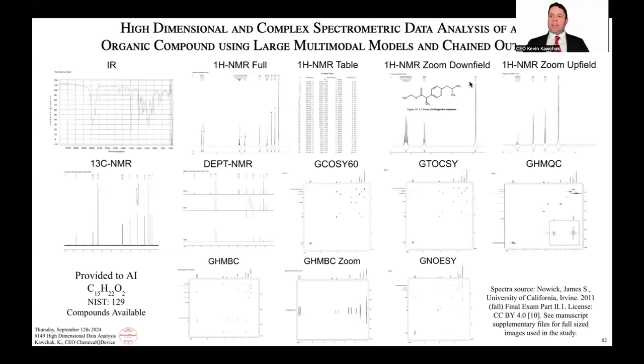So what had happened is, I took all these spectra and manually calculated where all the resonances are, the chemical shifts, as well as splitting patterns, for proton and then C13 DEPT. And then the 2D NMR, it's about correlations, so I did the correlations as well. And this was the structure that 3.5 Sonnet came up with. And I'm going back and validating if this structure makes sense right now.